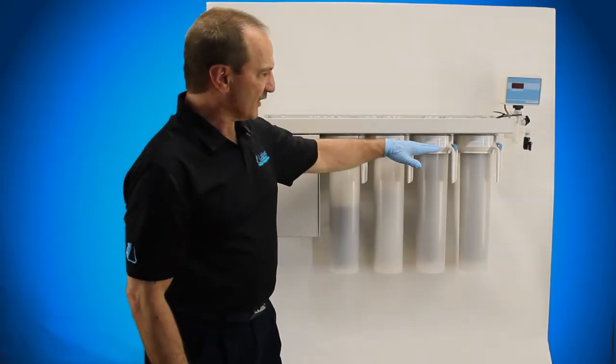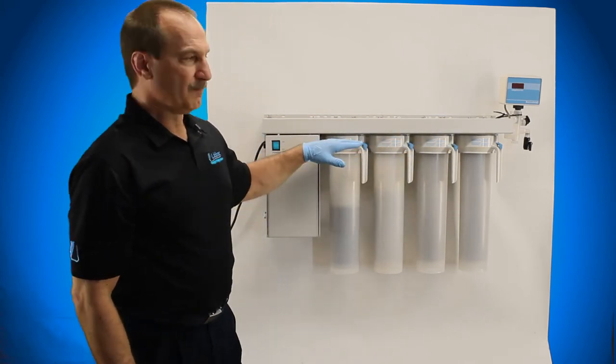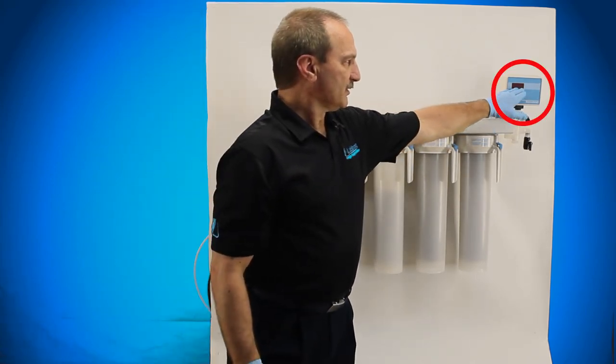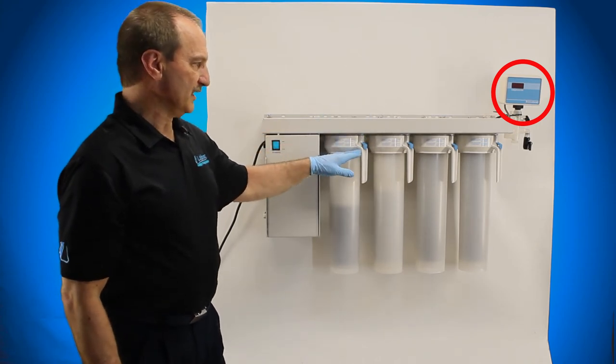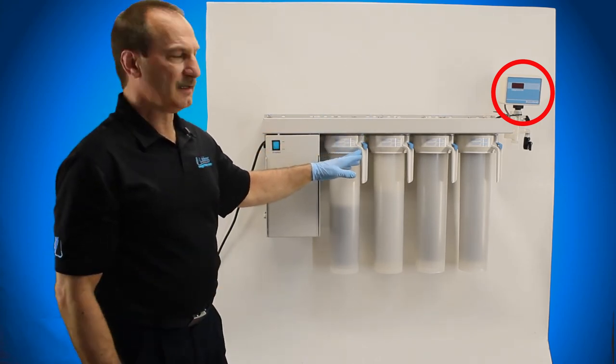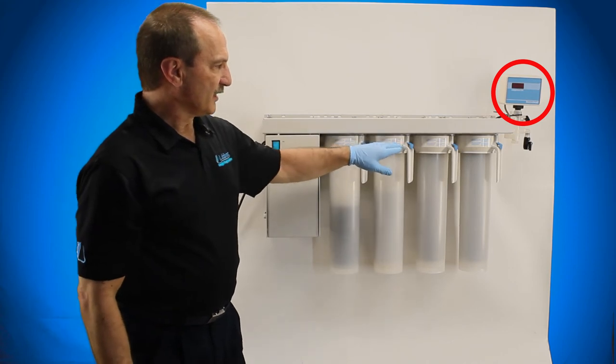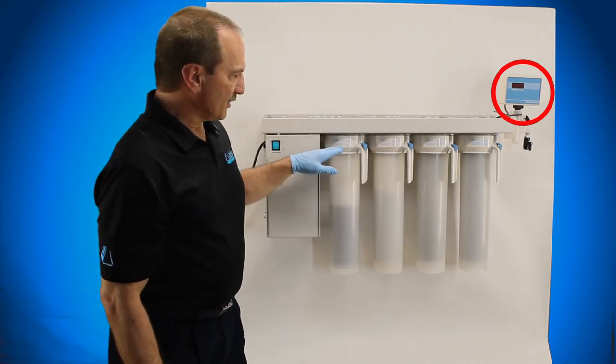If you don't put these in correctly and they don't seat, your purity reading up here is going to be zero, and you're going to want anywhere between fifteen, sixteen, seventeen, up to eighteen. But if you don't put them in correctly, you're going to end up with zero, and they're going to bypass every cartridge.